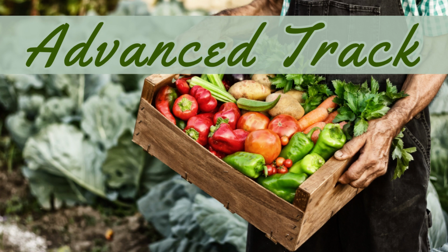Just a quick question, for someone who really doesn't know what he's looking at in the microscope. Okay. Just for a basic start, if I'm just looking really quick, I'm looking for life, and then I'm going to learn from there, of course. I'm never going to stop learning. But just take soil from my garden, look at it real quick.